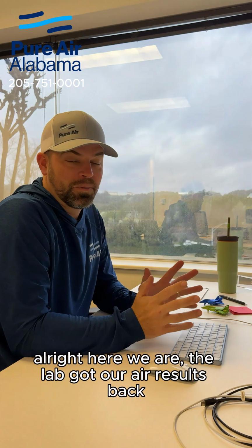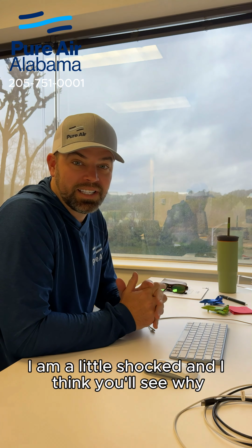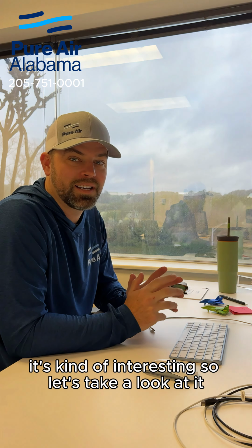All right, here we are. Lab got our air results back. I am a little shocked, and I think you'll see why. It's kind of interesting, so let's take a look at it.